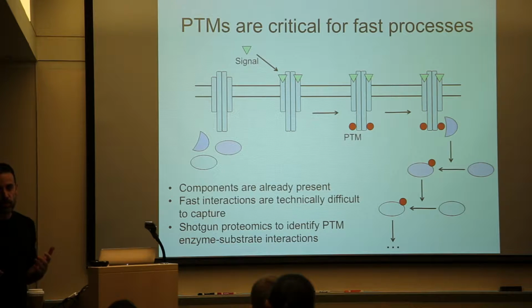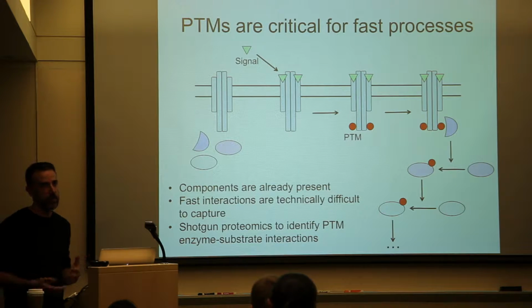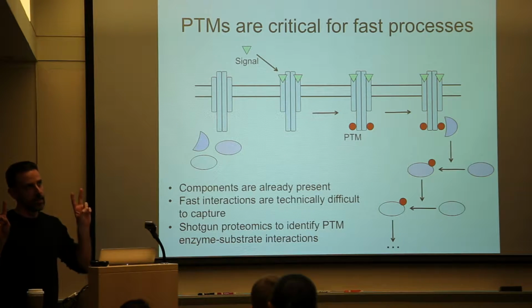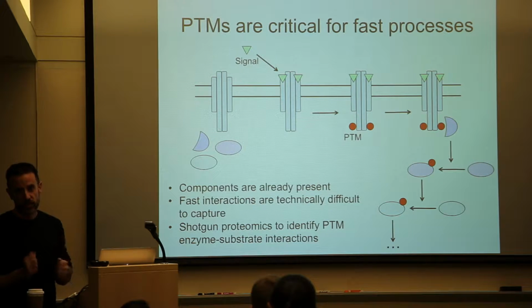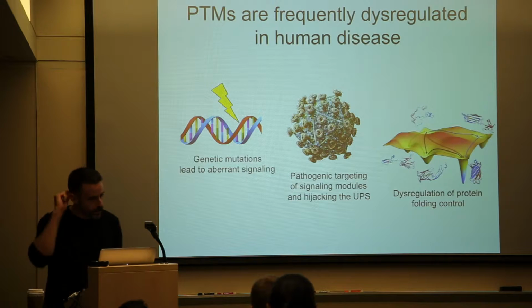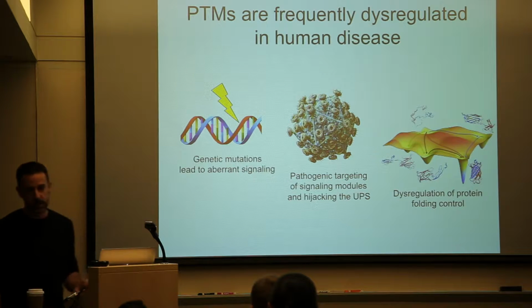And again, that's something that you couldn't really do 5 years ago, but now technology is so fast, the methods are so reproducible, you can very easily see essentially all phosphorylation and look for just those things that are changing, right?